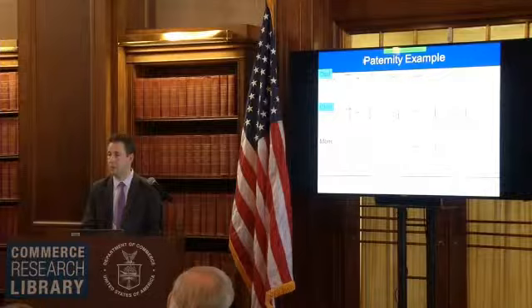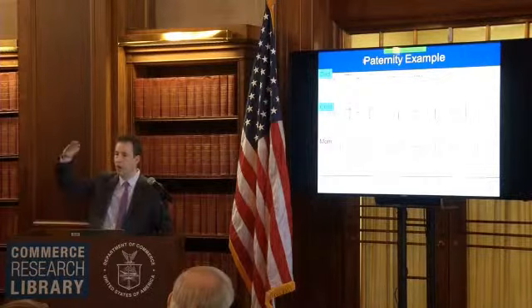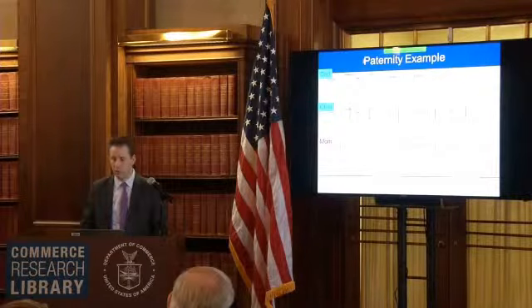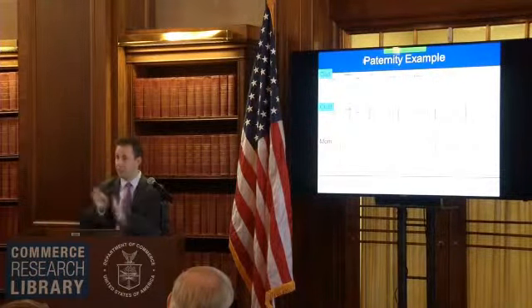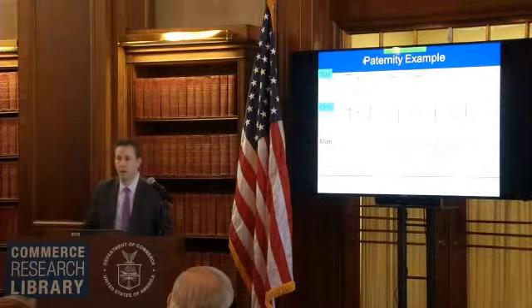Is that the same for all of the markers? Yeah, for STRs, it's common to say that it's about 10 to the minus third, so 1 in 1,000. But if you do more and more family generations, you'll see where these mutations happen. But you're right. The reason that these are polymorphic from an evolutionary standpoint is that they have been expanding over time. Can you comment on the signal-to-noise ratio?